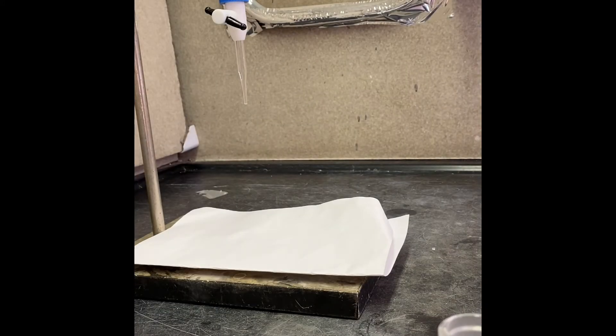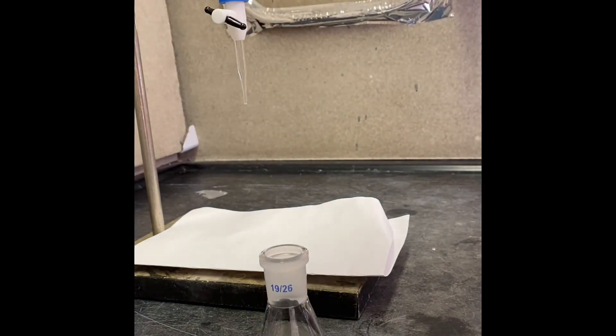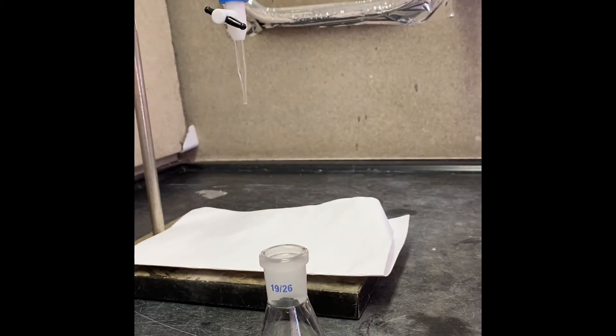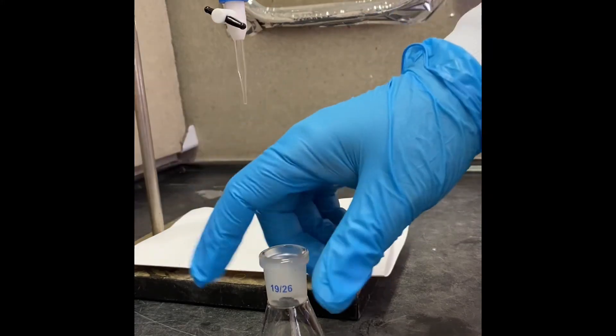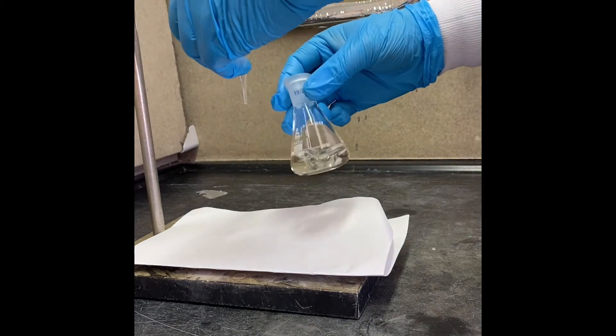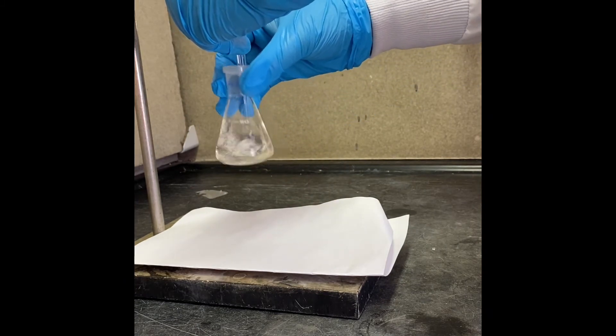Now we're going to figure out what happens after 100 minutes — what's going to happen with sodium hydroxide titration. We're going to try to find the endpoint and see what we're talking about.